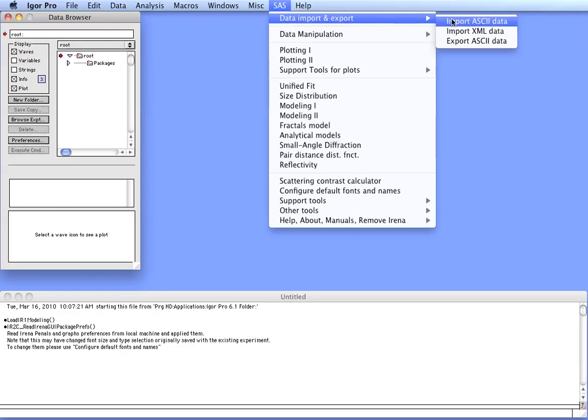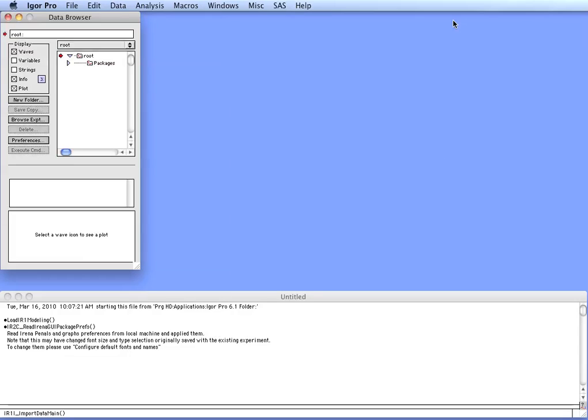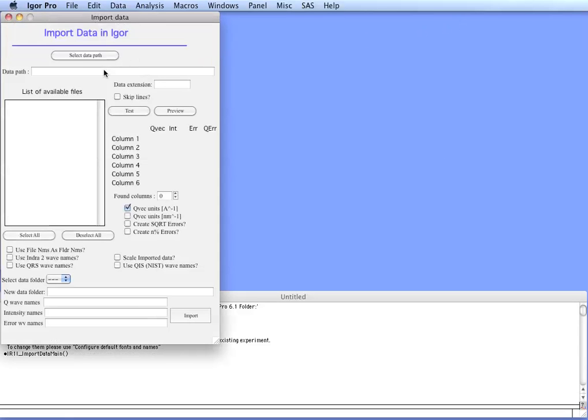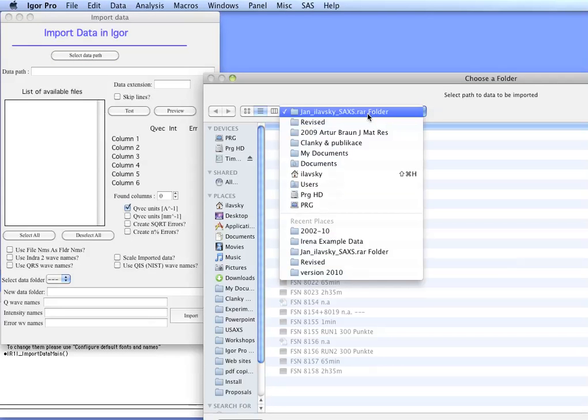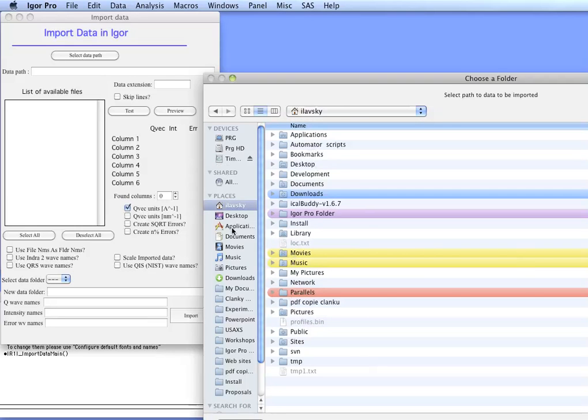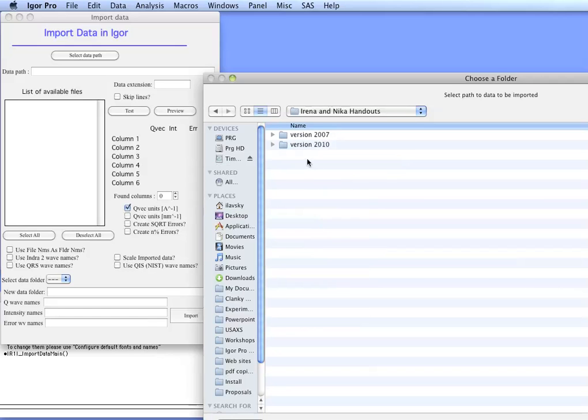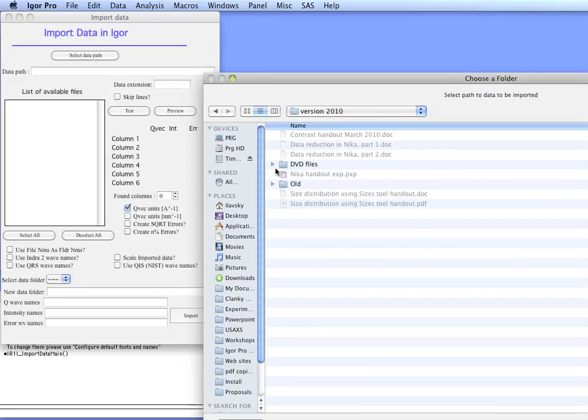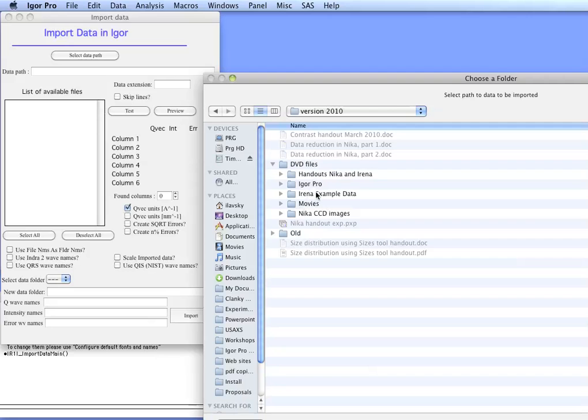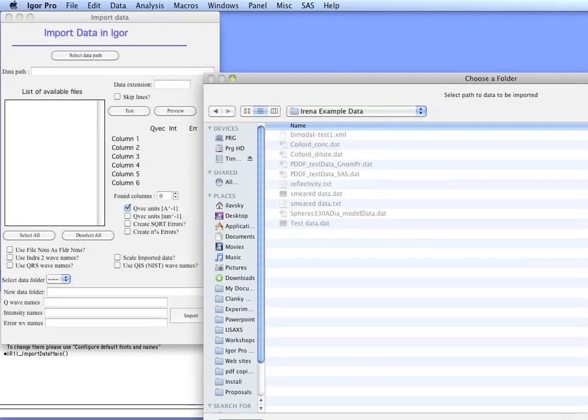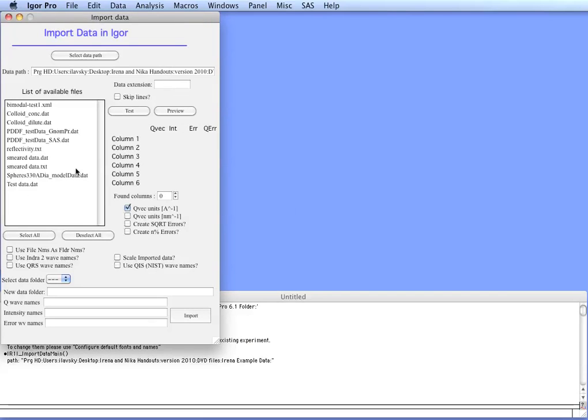First we have to get the data inside Igor, so we can take data import and export and import the ASCII data. We get an import data tool and here we select the data bar. In our specific case we have the data located on the desktop in handouts 2010. Here are example data. These should be included or can be downloaded from the web. In our case we are looking for test data.dat.